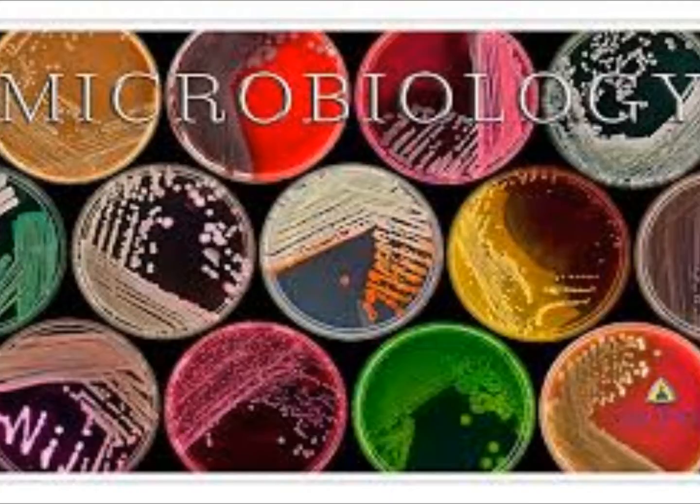And a beta hemolysis is a complete lysing of the RBCs. And it results in a clearing zone around the actual colony. So you can see how these red cells have been completely destroyed. And in this right here, there's a clearing around the actual colony. So there's no red cells left there. And these bacteria produce beta hemolysins, either streptolysin O or streptolysin S.